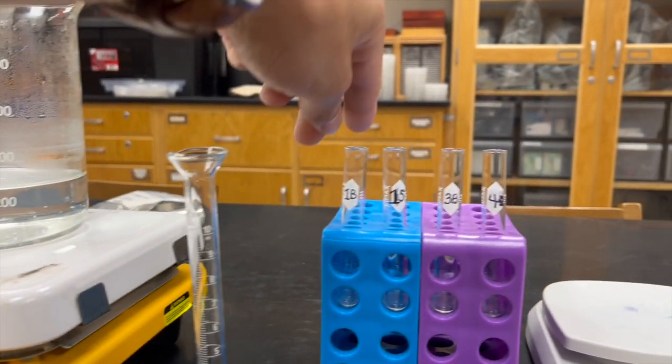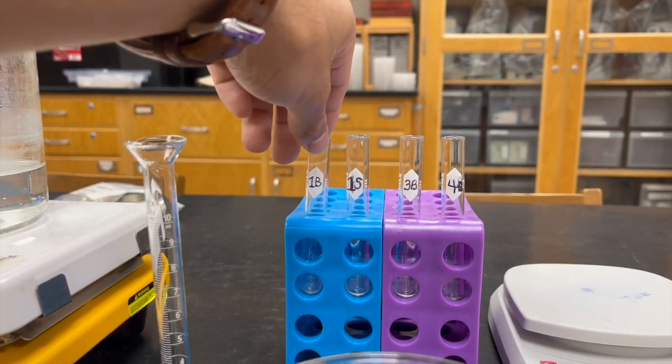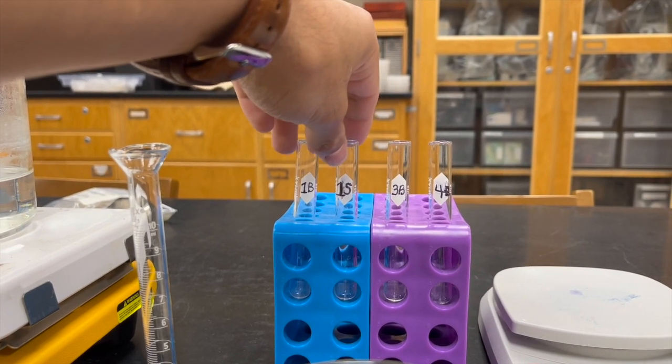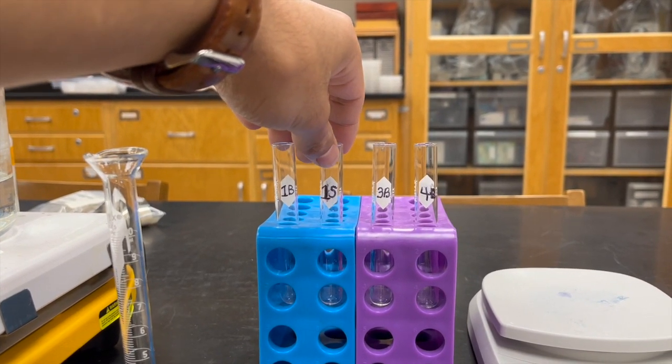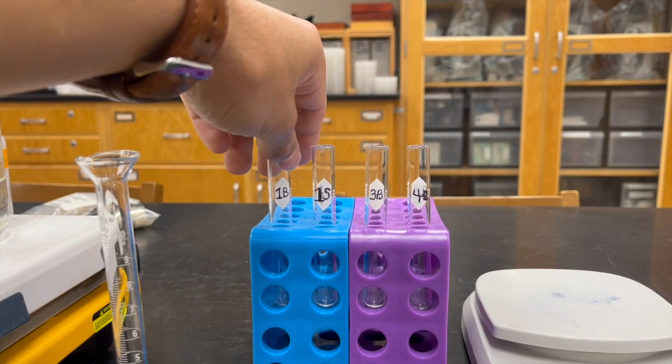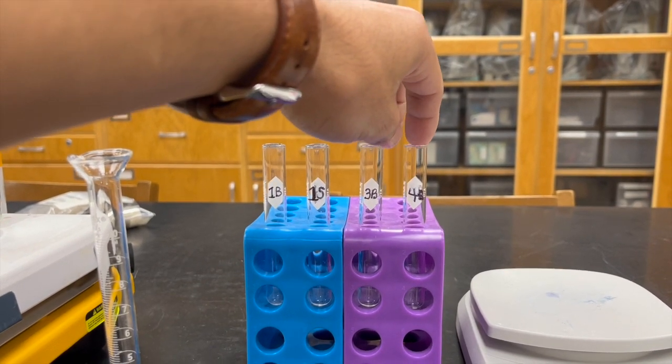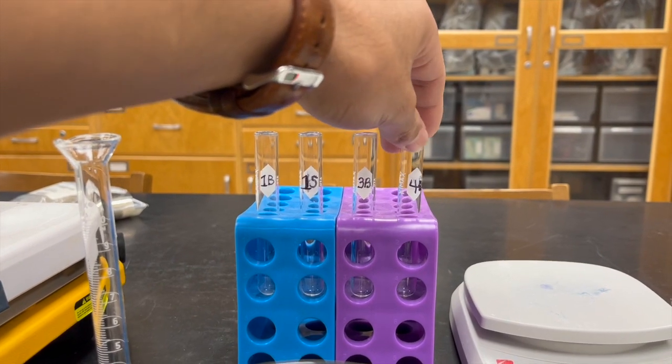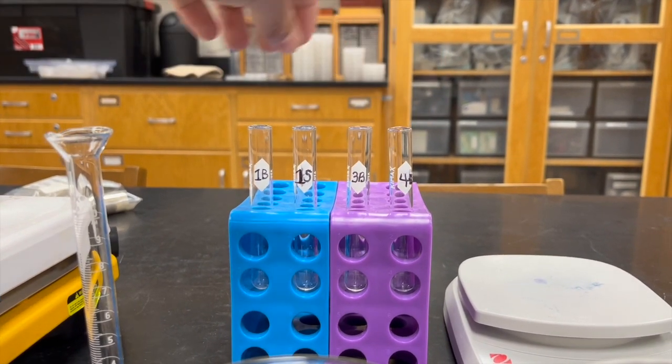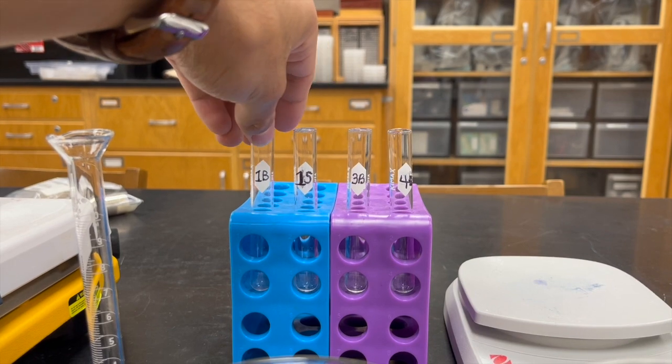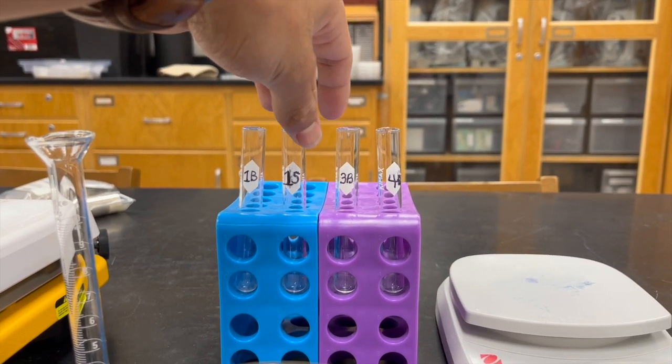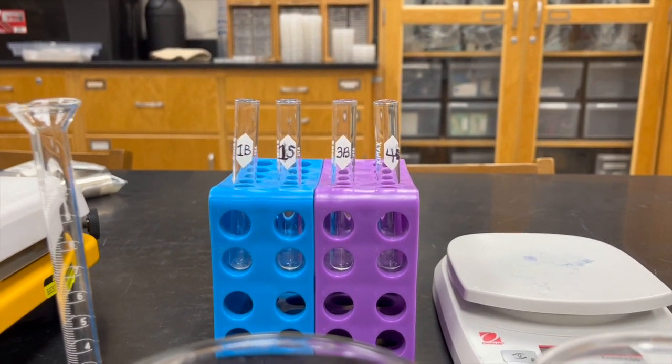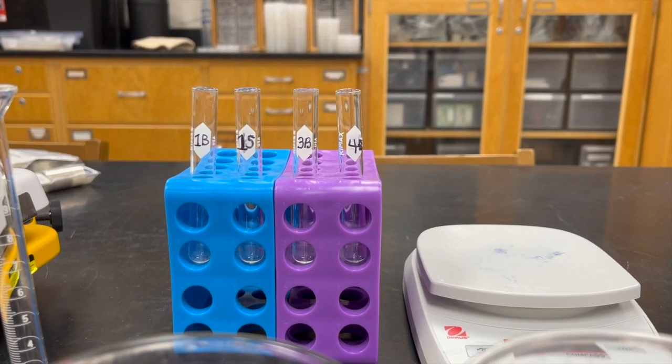The first two, 1B and 1S, are going to be in there for about two to three minutes, and this one takes a little bit longer, roughly five minutes or so. The instructions are in the lab manual, but you'll boil them, take them out, and get your test results. Then you'll write your test results down.